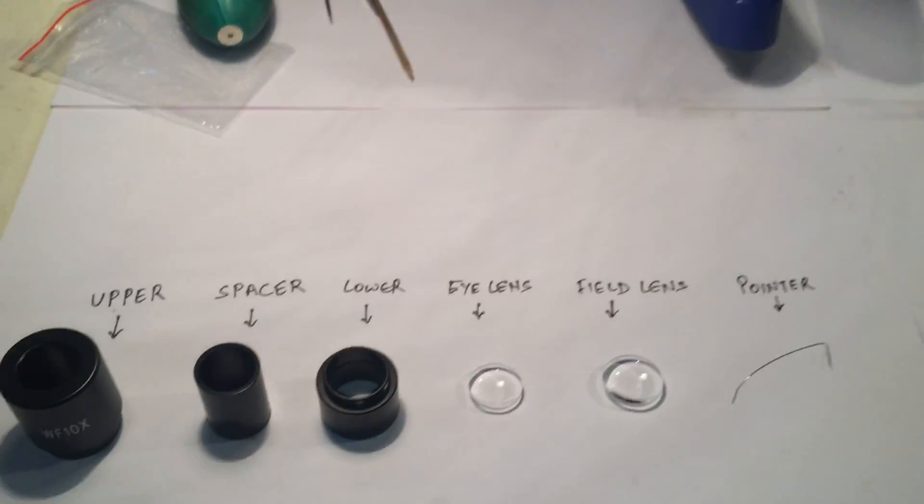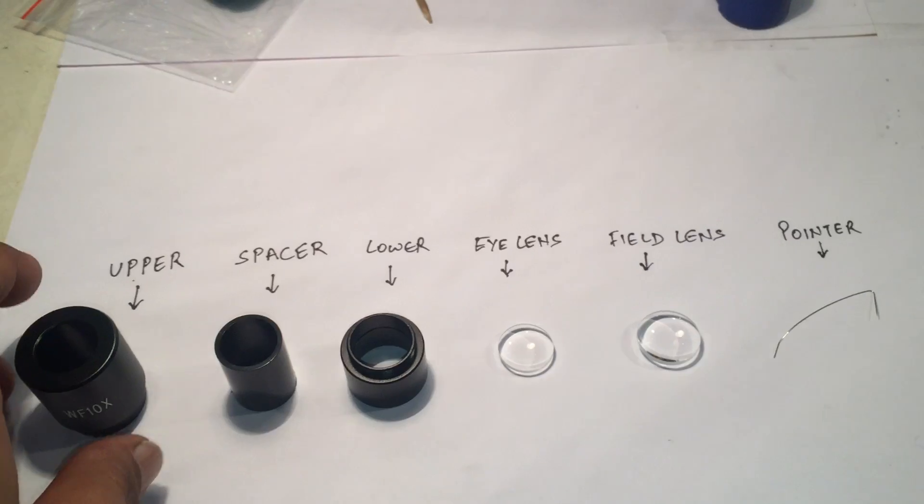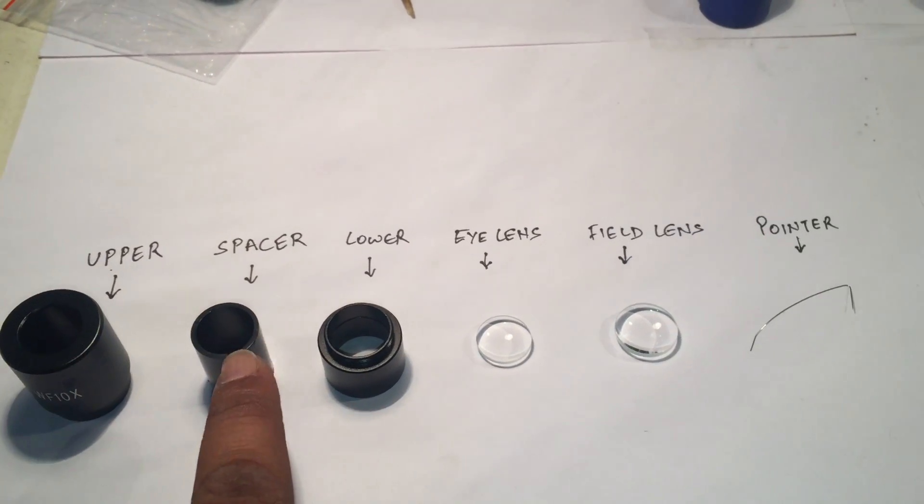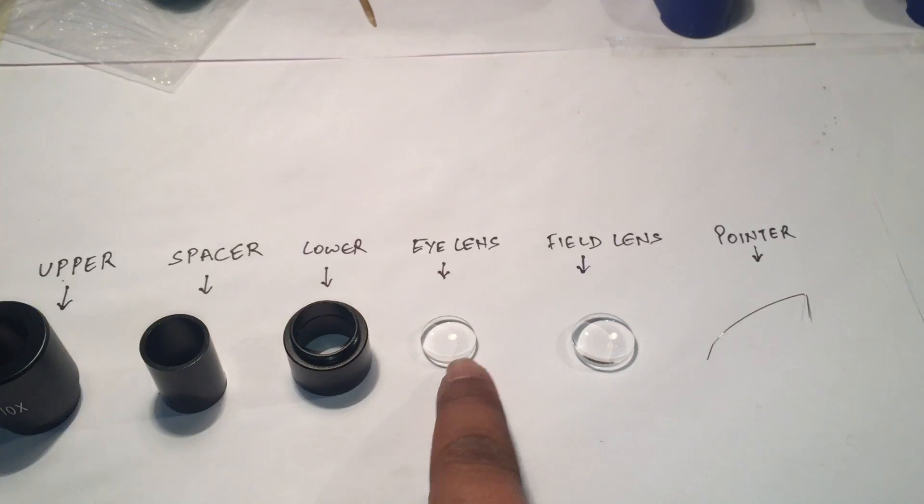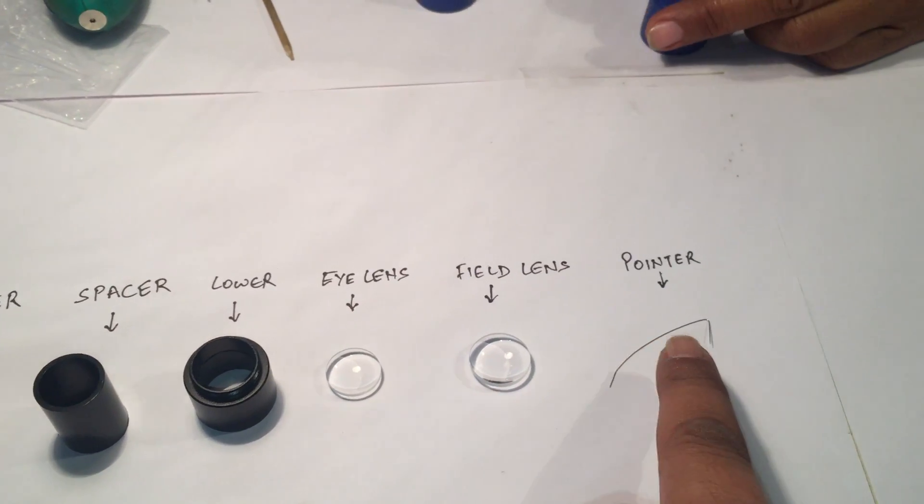Folks, I am telling you again the parts of the 10X. This is the upper part, the spacer, the lower. The small lens is called the eye lens. The bigger lens is the field lens. And this is the pointer.